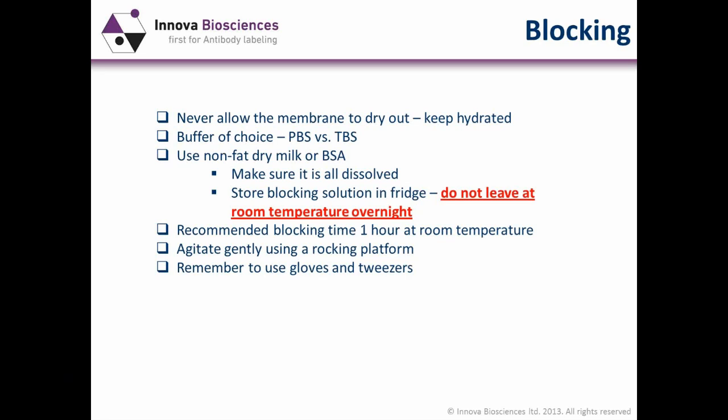They'll add their 5% milk and not allow the stirrer to dissolve it efficiently. What they end up with is a mixed solution of powder, some of which is in solution and some of which is not. Spend 10 minutes prior to starting the blocking step to allow your milk or BSA to dissolve efficiently.